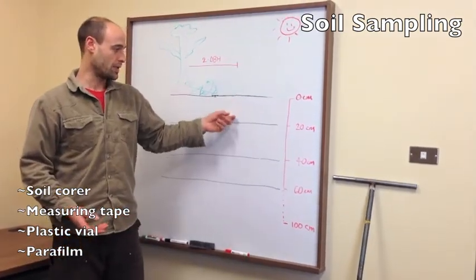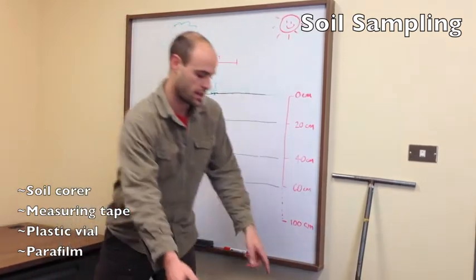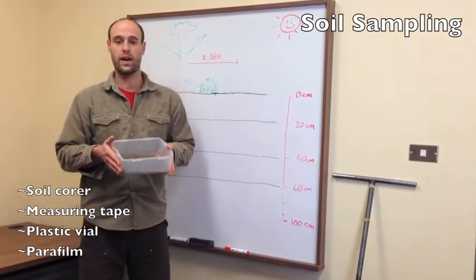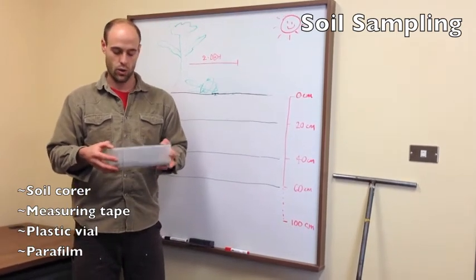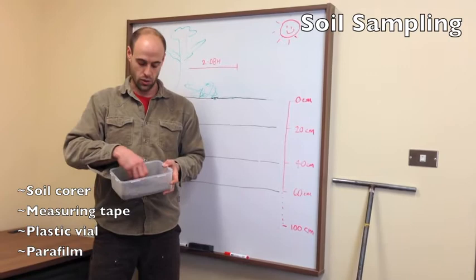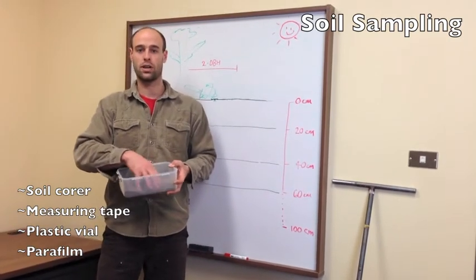Once you've dug down 20 centimeters, remove the soil corer, take the soil, and we find it easiest to dump the soil into some sort of bin or container which you can then mix it in. So take your hands, mix it up, get it good and mixed.